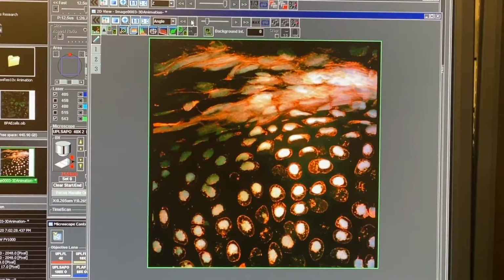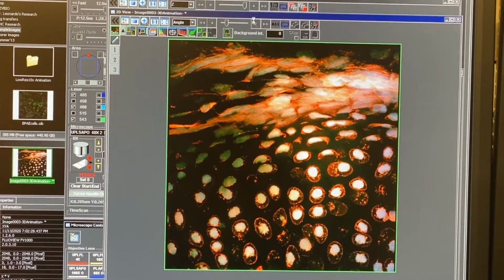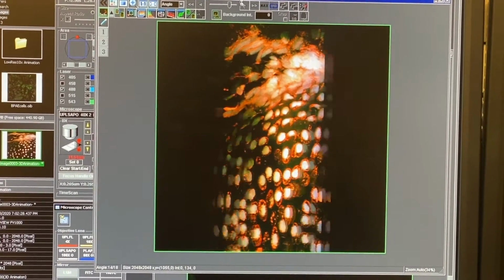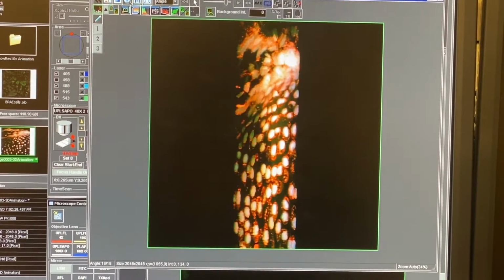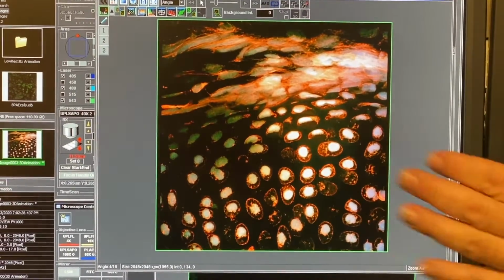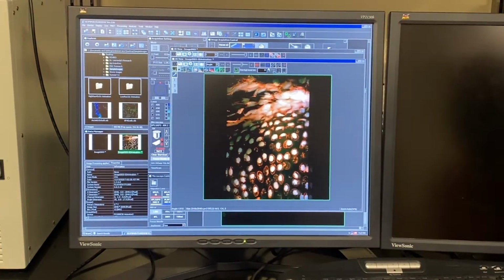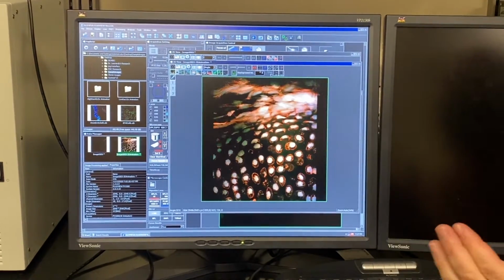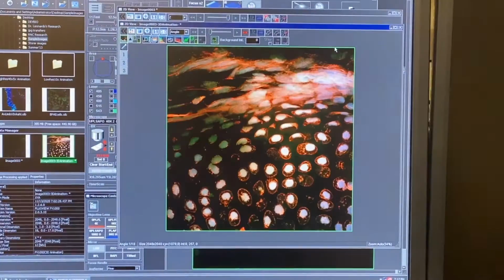This is a fun optical illusion because it is a 2-dimensional screen and we're trying to look at a 3-dimensional object. So is it moving to the left or is it moving to the right for you? Is the left side moving backwards or forwards as you do this? Is it moving out of the plane towards you or back in? Let's speed it up. Pick a single cell, focus on that cell, and try to watch where it is, and are the cells near it above it or below it. Slow it down so you don't get too dizzy.